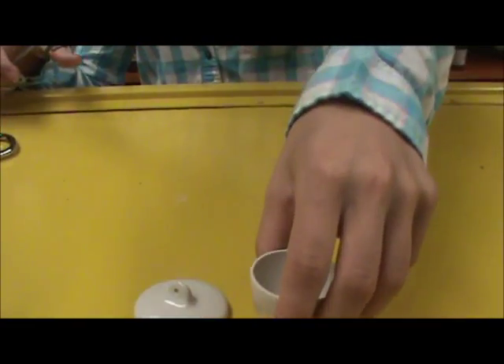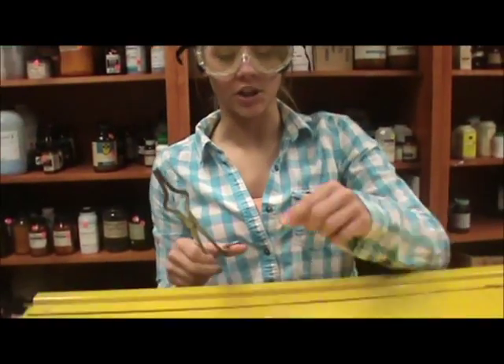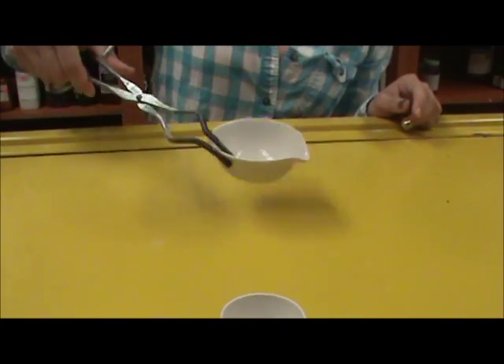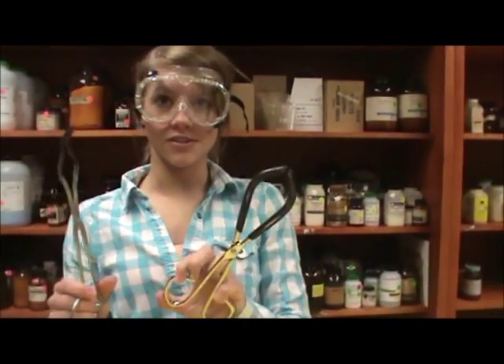While being able to use these on the crucible, you can also use crucible tongs on the evaporating dish. To do this, you squeeze the side of the dish and pick it up. And that is using beaker tongs versus crucible tongs.